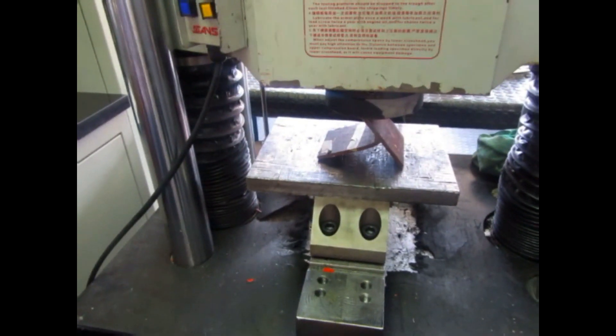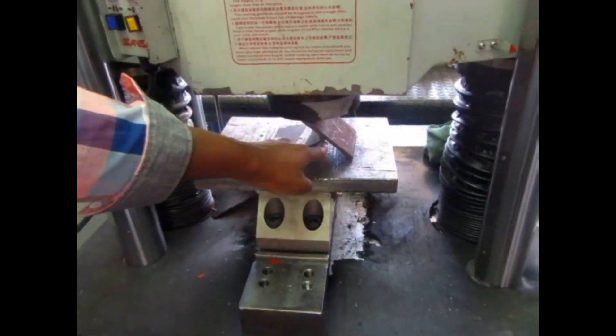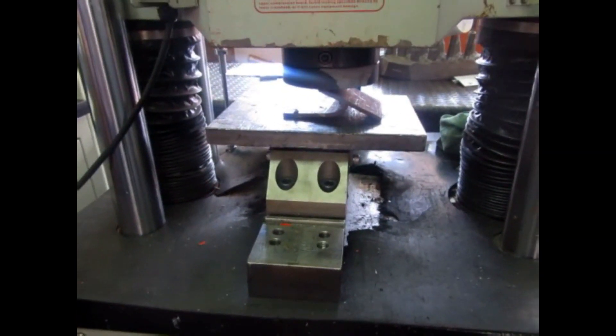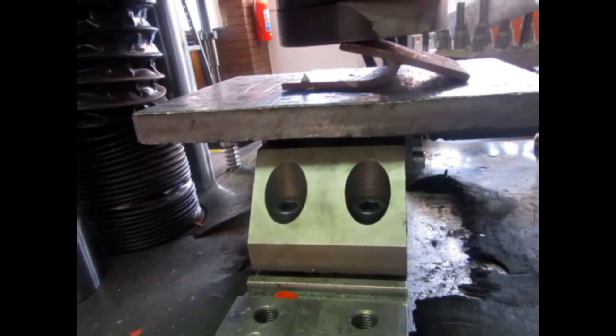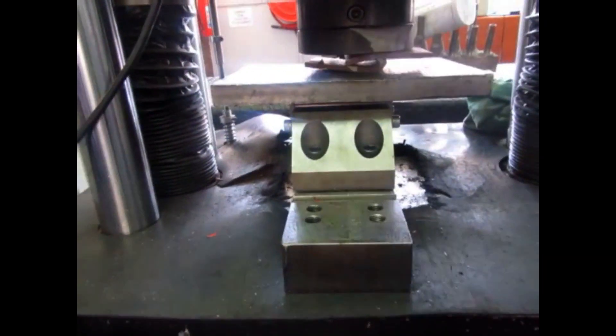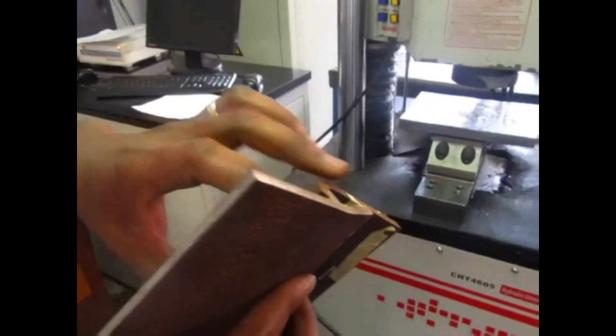From wherever you're receiving me now, I welcome you all. Today we're about to witness the test and evaluation of a fillet fracture test. This consists of the opening of the roots of one side fillet weld sample by applying a certain amount of force until the root opens.